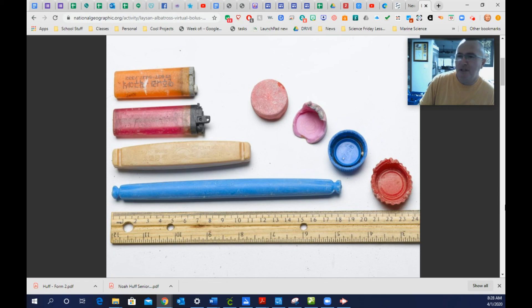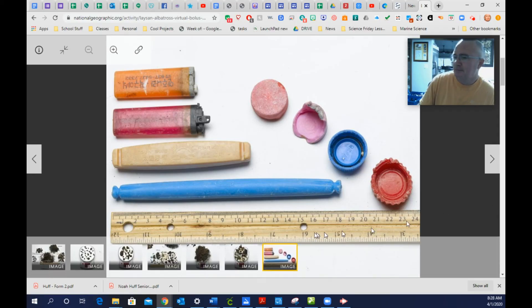This is the last image. This is the information you need to properly answer all the questions in the lab handout. Good luck.